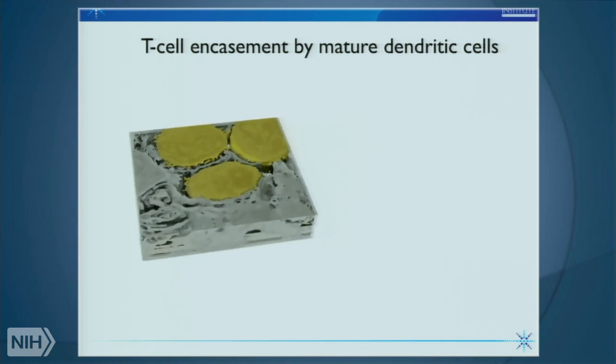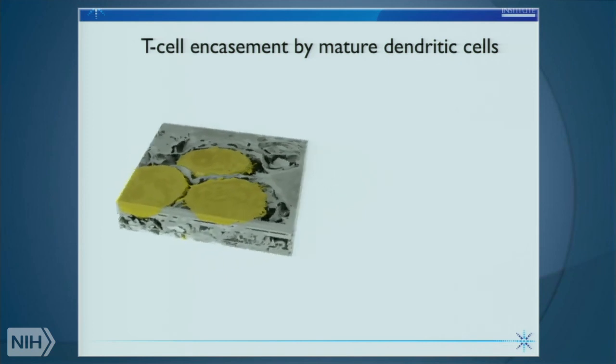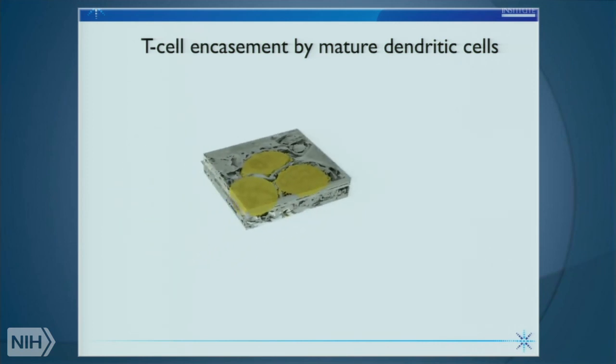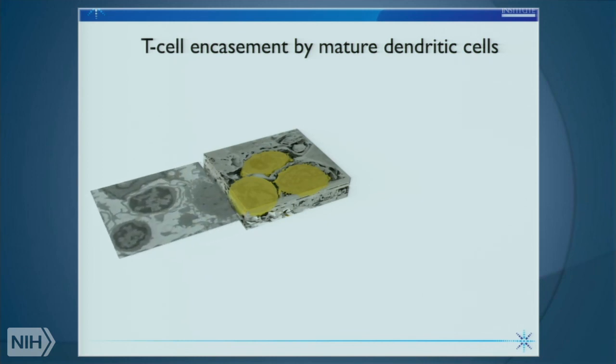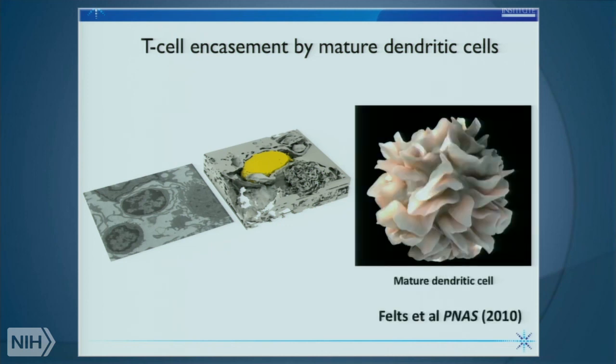And one problem in particular that we really wanted to understand was the nature of transmission of viruses from a dendritic cell to a T cell. Using these methods, we were able to image in 3D the contact zones between dendritic cells and T cells, and recognize that what looked like dendrites in 2D, that you see at the left, actually are not dendrites, but huge walls of membranes that come out of the dendritic cell, and the virological synapse itself is nestled deep in this contact zone.